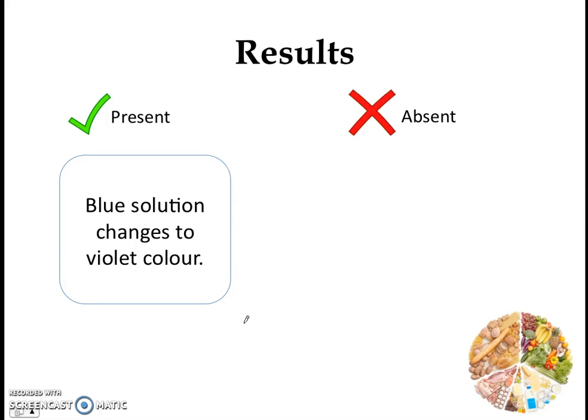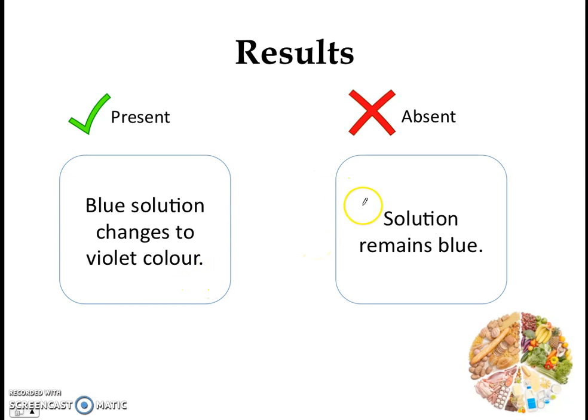Now, if proteins are present, then we will see that the blue solution changes to a violet color. Right, you should have seen this in the video. But if protein is not present, then the solution will remain blue.